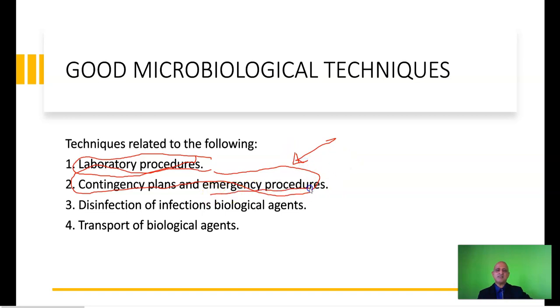There has to be an emergency procedure in place for this, as well as for large spills and fires, and disinfection of infectious and biological agents using specific agents with the requisite concentration and contact time, and finally the transport of biological agents from one facility to another or within the facility itself.